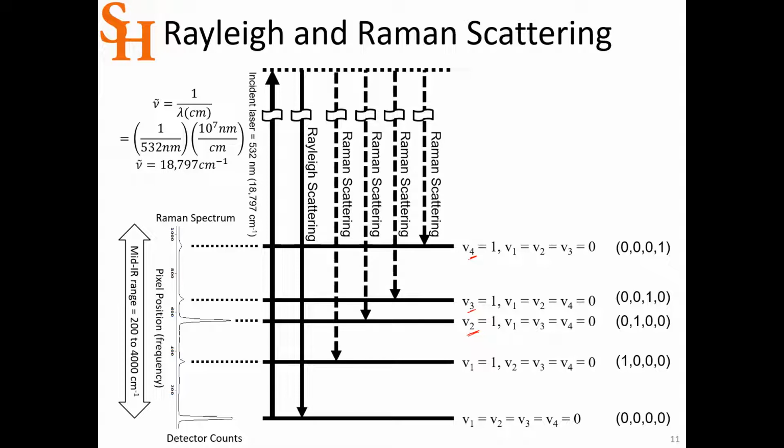You might have to look at the intensity and say, well, even though this peak is coming out at a little bit lower frequency, it's got the intensity that would match this strong peak in the spectrum. And so you need to defend your assignment. And it's not too hard. You just look at the frequencies. That gets you 90% of the way there. And then look at the intensities and line those up for something in the same region. Okay. And so that's what your defense would be.